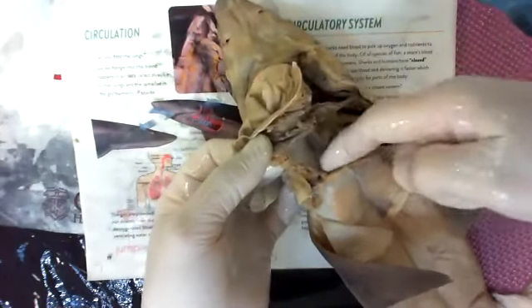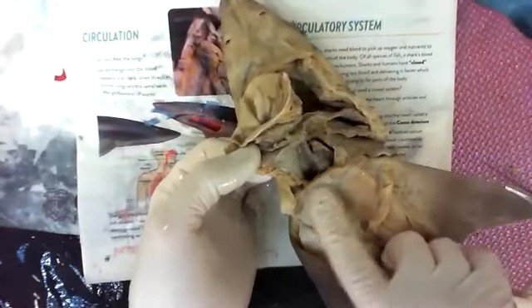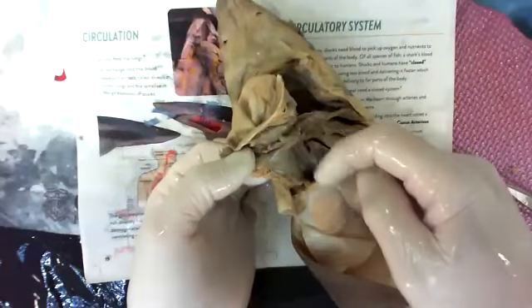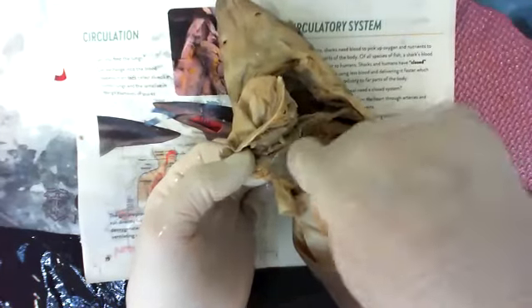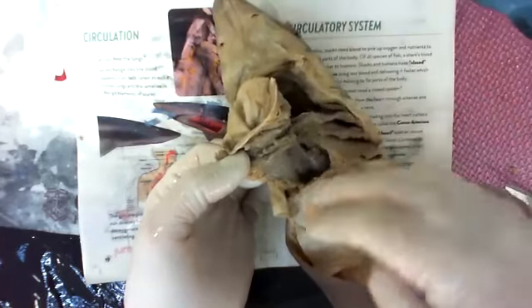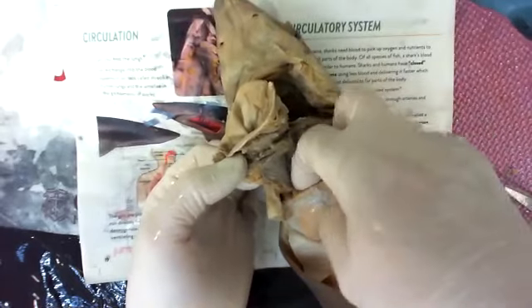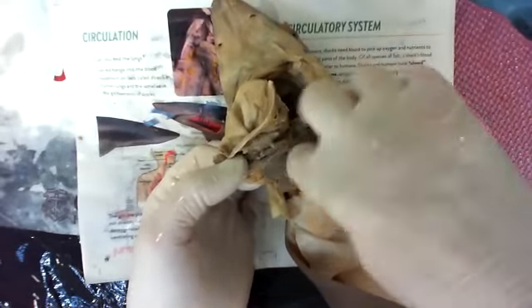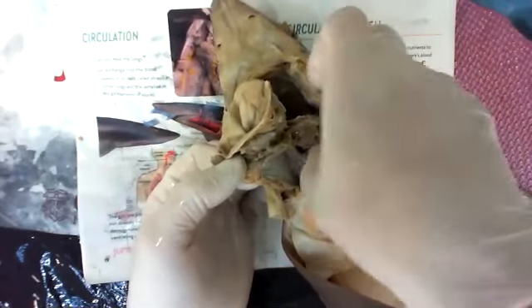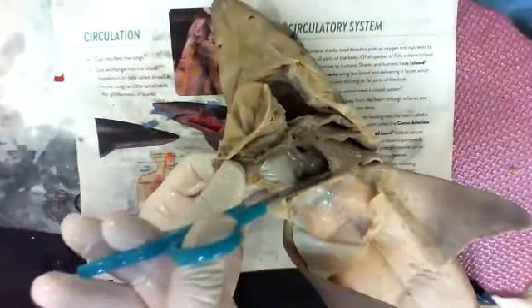You can feel there's a sac along the bottom. That would be, I should look it up. I don't know if that's the diaphragm in a shark, because the diaphragm in you helps you with breathing. It moves your lungs, and it separates your thoracic cavity, where your heart and lungs are, from your abdominal cavity, where all the other guts are at. So I can feel there's a muscle or a membrane right here that separates this chest from everything else. Dang, I'm gonna have to look it up. I'm still learning. I like it.